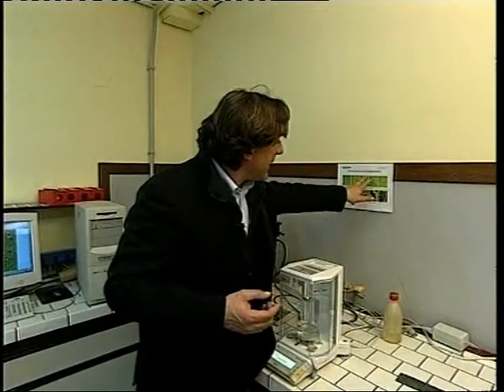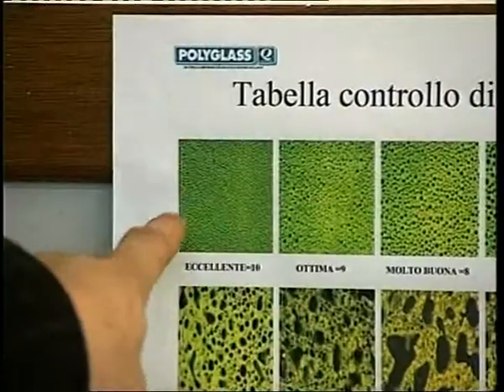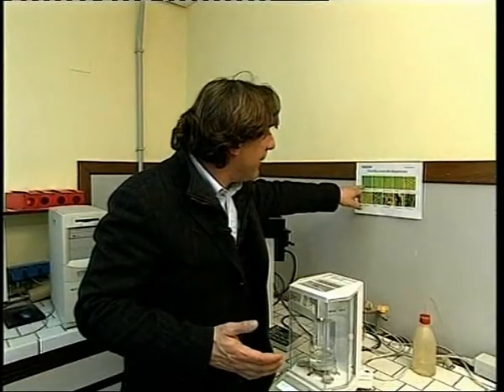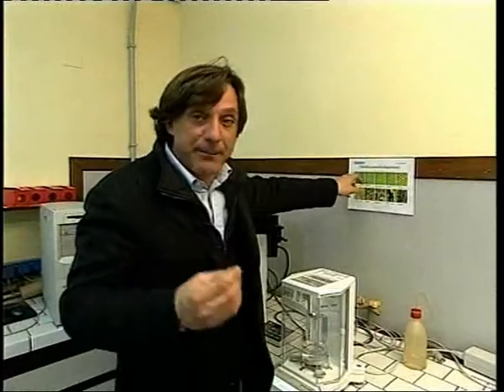As you can see, the homogenization of the resin is all the better and more constant to the degree that the quality of the resin is better and constant. Here's an example of excellent dispersion. The green part is the resin. The black part is the bituminous mix.